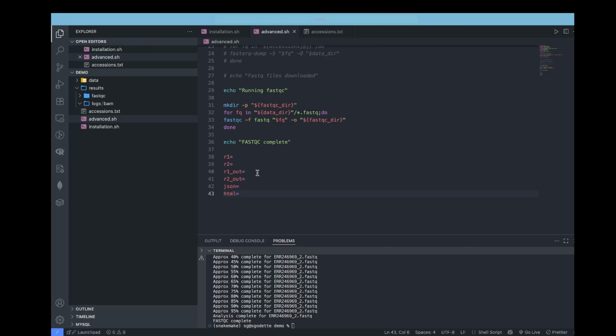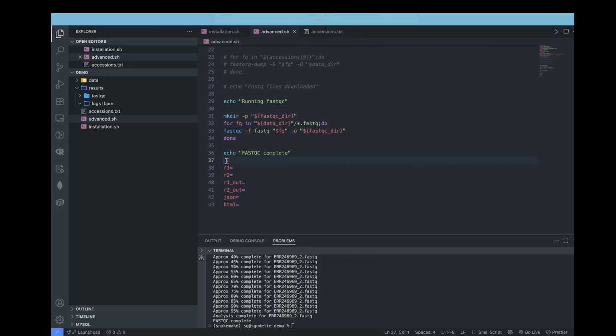Now, how do we create these files? The simplest way is to iterate over the FASTQ files we have in our data directory using a for loop, as simple as running for FQ1 in the data directory. So we can just copy paste. Actually, we can just copy paste this entire line of code here because it looks in the data directory. But here, remember that I put here FastQ1. Basically, what I'm saying is I want to start working with these files that are written _1.